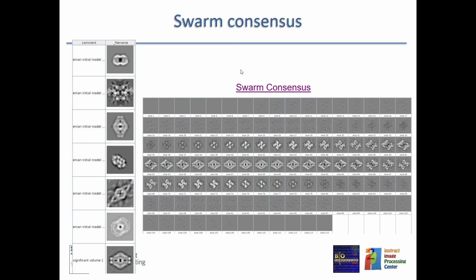And here, I said it wrong. We don't want to minimize, we want to maximize. So we have three local maxima. We have these two and this one, that is the global one. Then they are following somehow locally this gradient.